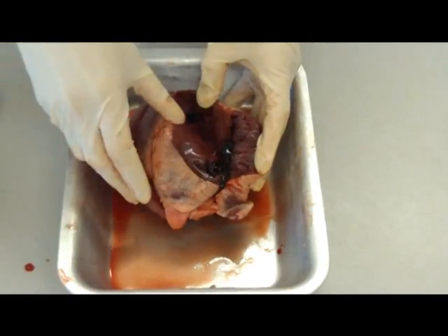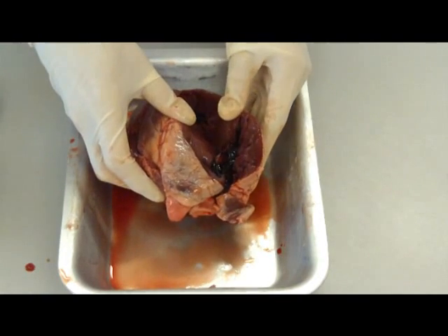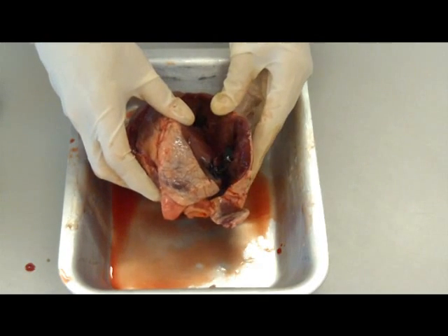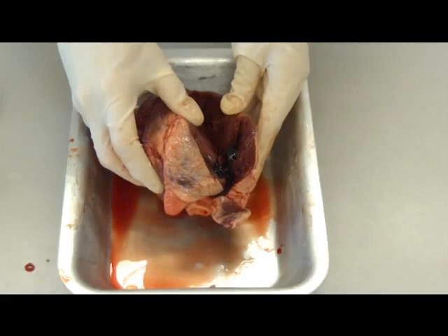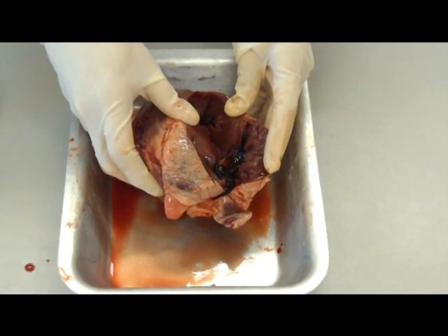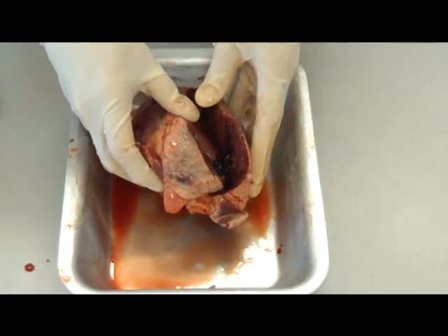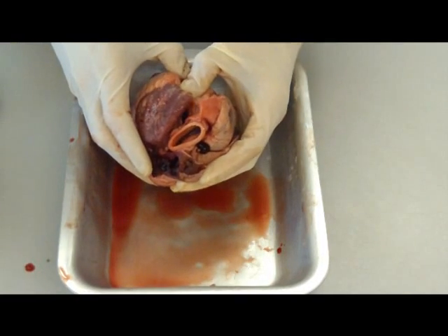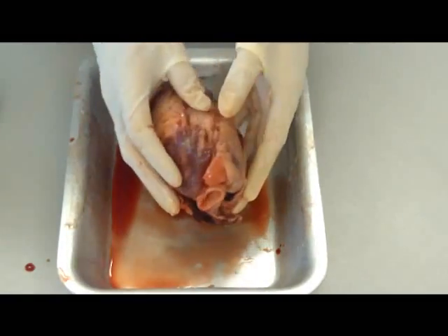Basically, the heart pumps blood around the body. You've got your four chambers. The right side of the heart will actually take blood without having any oxygen, and the pulmonary artery will actually then pump it round to the lungs to pick up oxygen. It then goes back into the left side of the heart through the pulmonary vein, and then it's actually pumped out at the top of the heart through the aorta, which is a major artery, and pumped to the rest of the body. This is why the left side is bigger and more muscular.